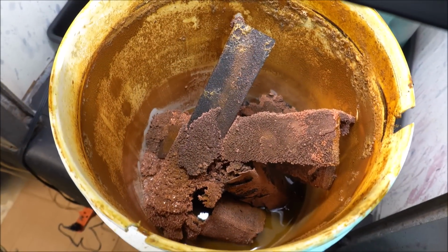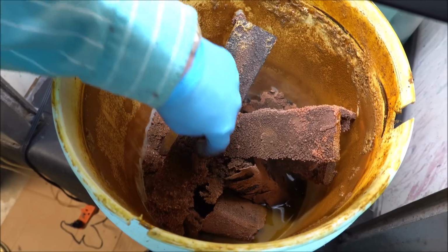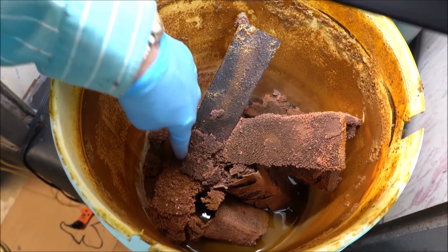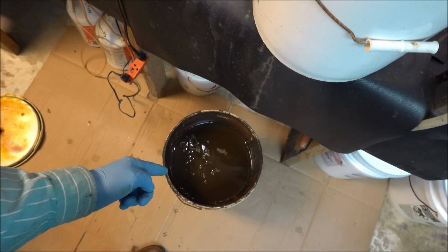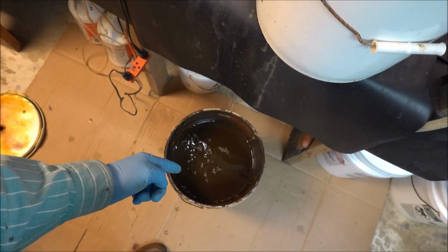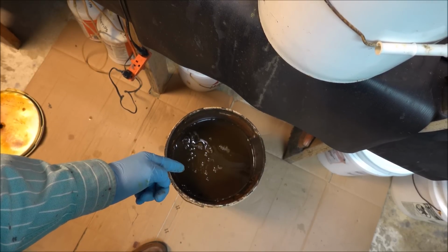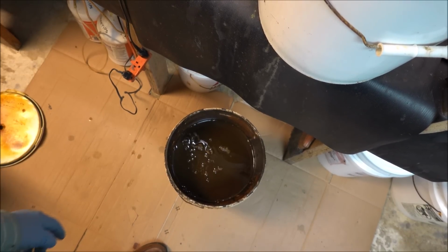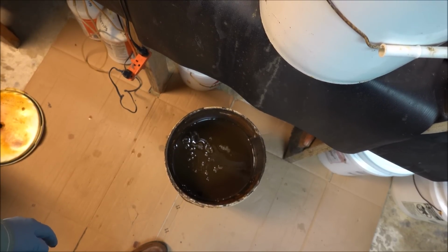Here's what's left in the waste treatment bucket. These are pieces of iron. This is the copper that came out of solution. It cements out onto the iron. The iron goes into solution. The iron ends up down here in this bucket, and then I'll treat this with sodium hydroxide to drop the iron out of solution as its hydroxide, and we'll filter it out and dispose of it after it's been completely neutralized to a pH of 9.